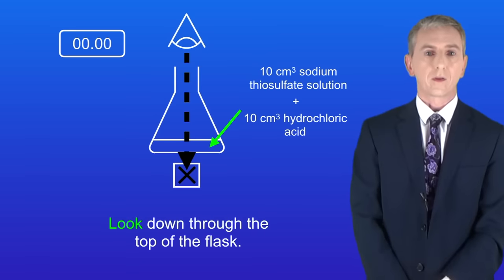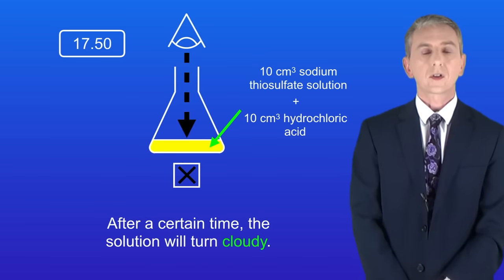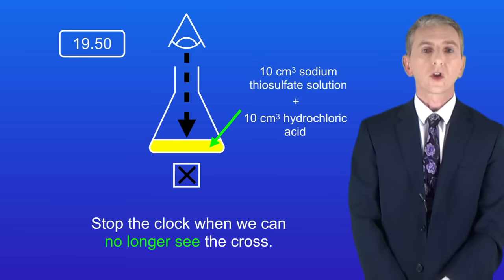We now look down through the top of the flask. After a certain time the solution will turn cloudy. We stop the clock when we can no longer see the cross.